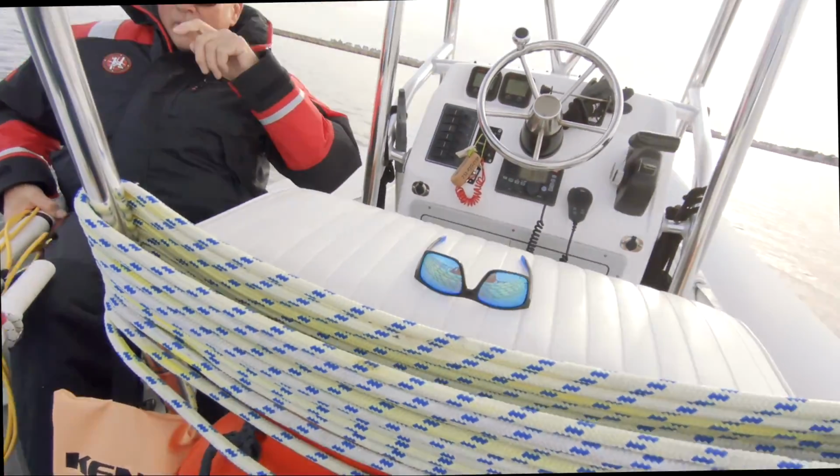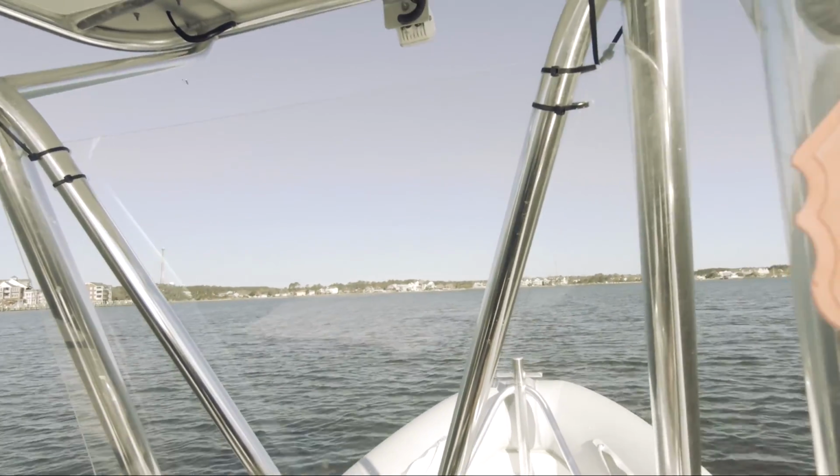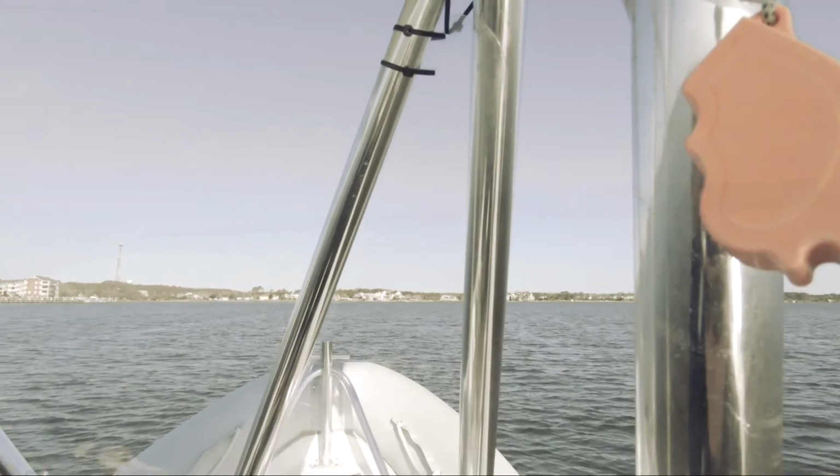60 total readings are recorded for each boat ride weekly. Observing proper sampling techniques, the rest of the boat ride is repetition.